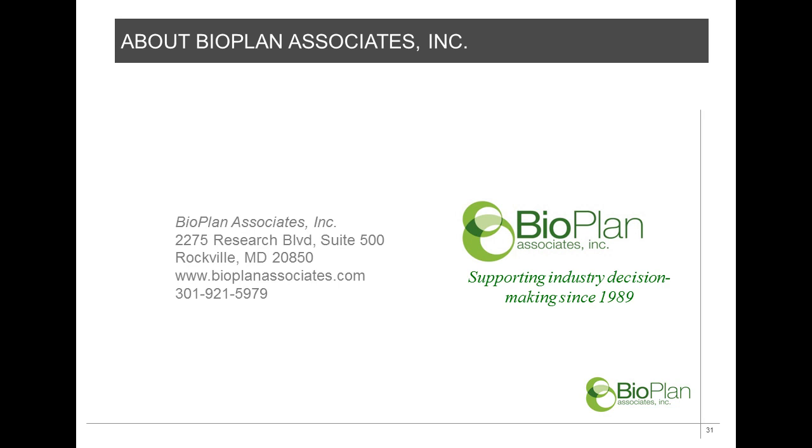If we start to add issues of, are you using IBD or some other method, then if that became a major cost factor, it would likely have shown up when we were interviewing the initial bulk of end users, and they would have told us IBD versus batch storage is going to be a major factor.